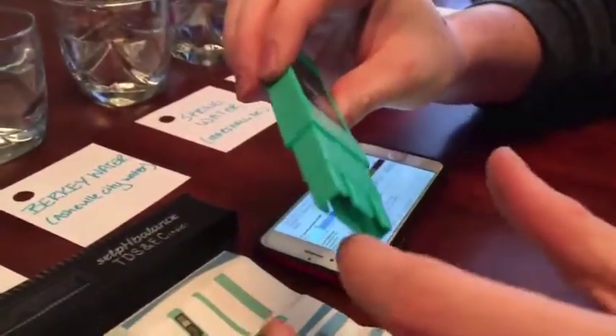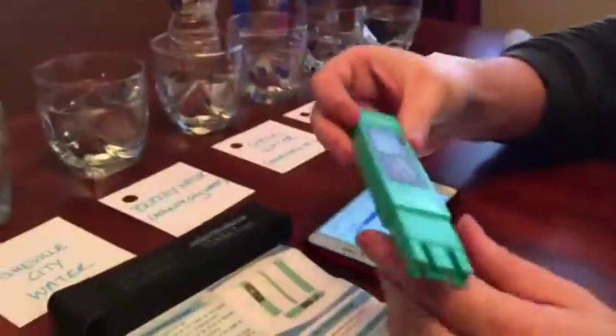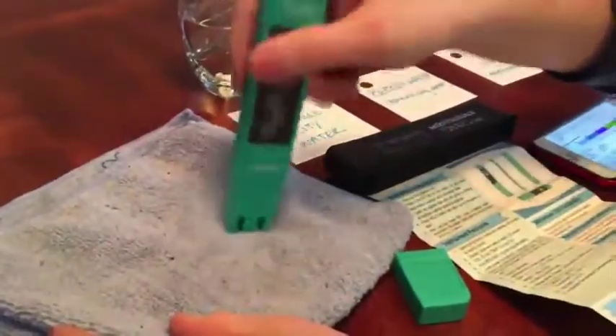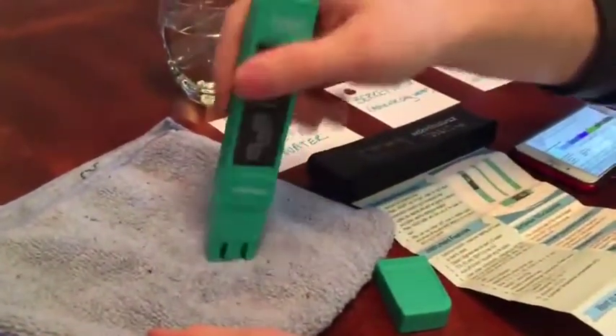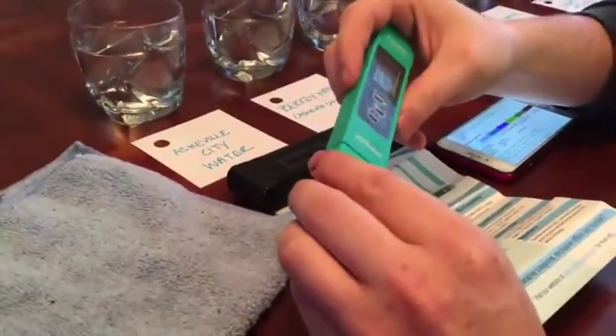Following the directions, we remove the protective cap. You always want to be protective of the tips — there's a little plastic there and you don't want to drop it or submerge it completely in solution. After using it, dab out the water and let it dry before putting the cap back on to store.